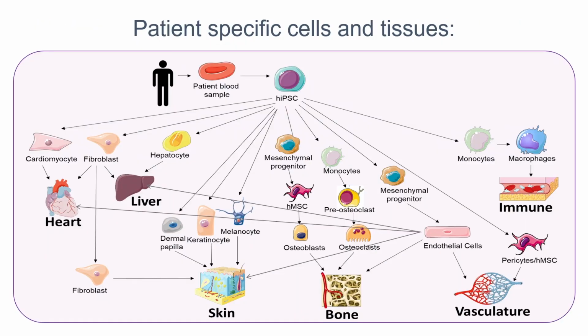The MPS also brought to us this need to work in a patient-specific context whenever meaningful and necessary. And actually what you see here is just a schematic, which is a very partial picture of what we are doing, meaning that there are cell sources such as induced pluripotent stem cells that we today routinely develop from blood. You just need a small test tube of blood.